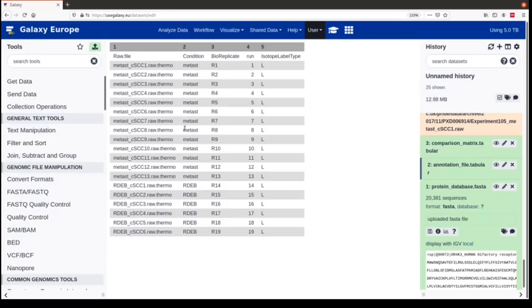It's really crucial how this annotation file is set up, and many of the MSStats errors happen here. The raw file name actually has to match the name in the evidence raw file column. We can later check that out. It's very important that this name fits what is written in the evidence file — the output of MaxQuant — otherwise the metadata cannot be attached to the raw file names.